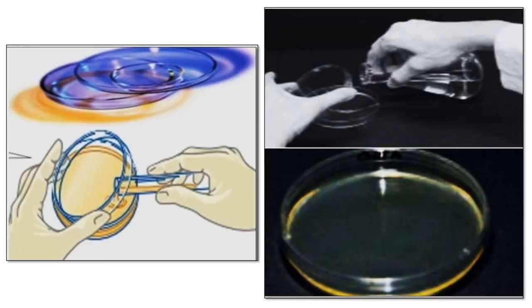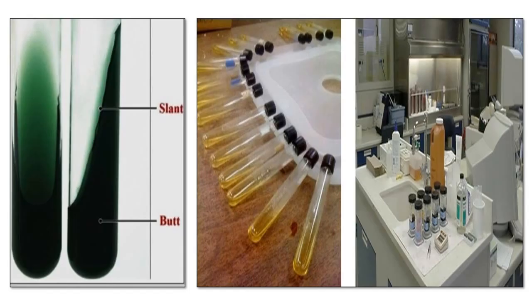In the same line, this slide displays how to pour media in Petri dishes. And this slide presents slant media in test tubes.